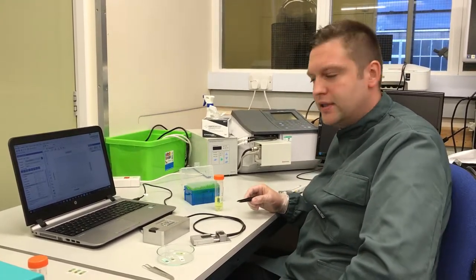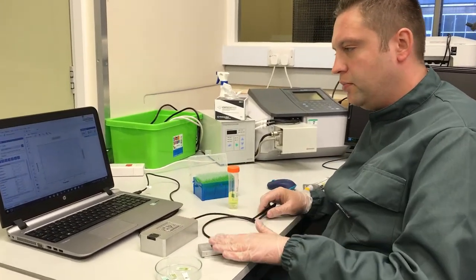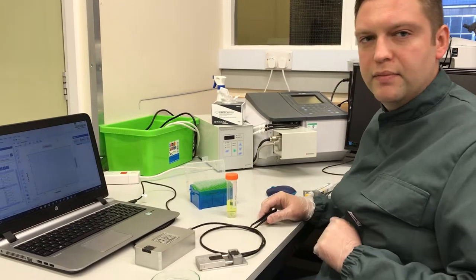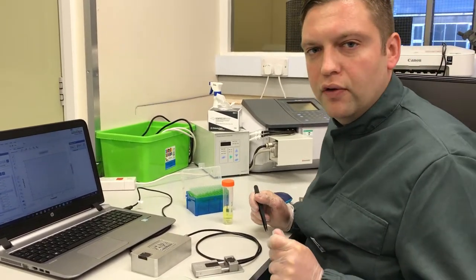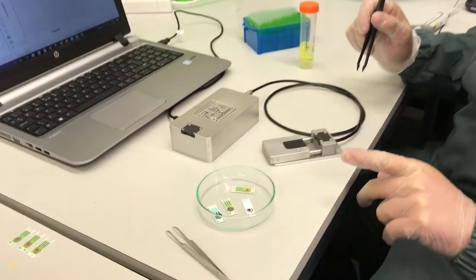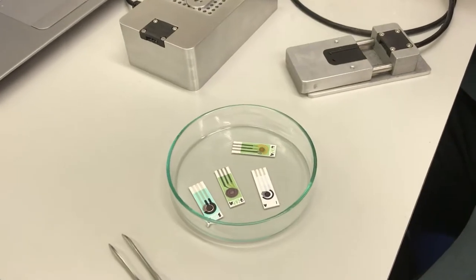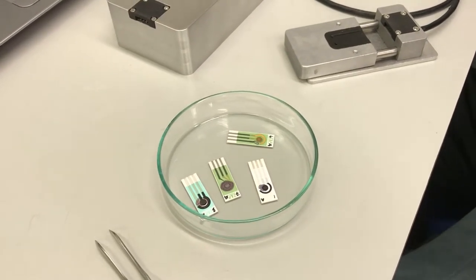Good afternoon. Today we are going to perform the electrochemical characterization of Zimmer and Peacock screen printed electrodes by using the system provided, the potentiostat detection platform and the software from Zimmer and Peacock. So we are going to perform the characterization of Zimmer and Peacock sensors previously modified with gold nanoparticles to increase the surface density of our sensor.